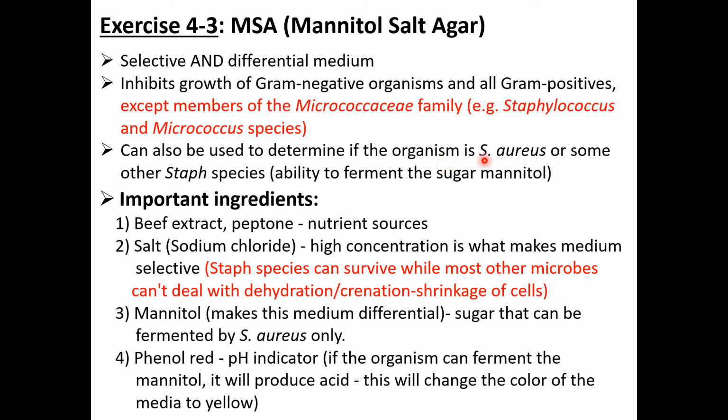Well, the only one that really matters is Staph aureus. Okay, so Staph aureus is the one that causes several types of human diseases, and it has a lot of virulence factors, and we'll talk about that in the disease unit. So we have a differential ingredient here, and that's going to be the sugar called mannitol, and Staph aureus is the only one that can ferment this type of sugar. Any other species of Staph cannot do that.